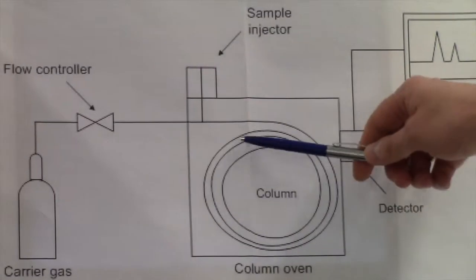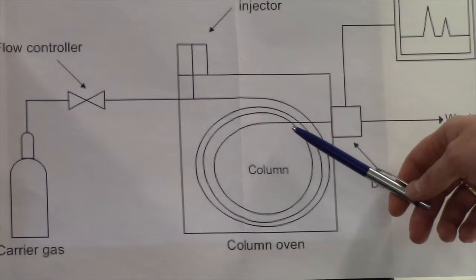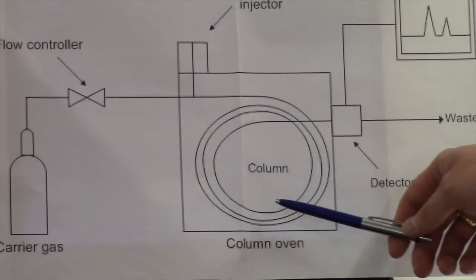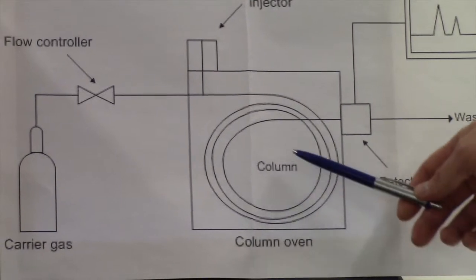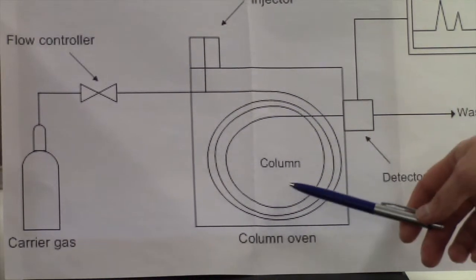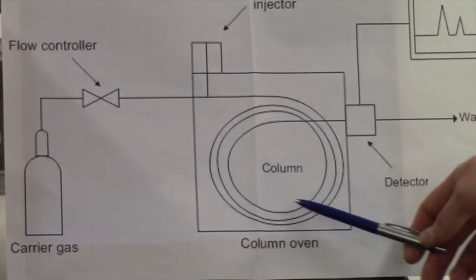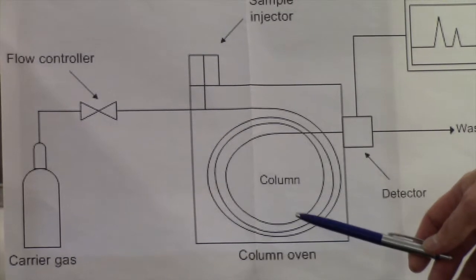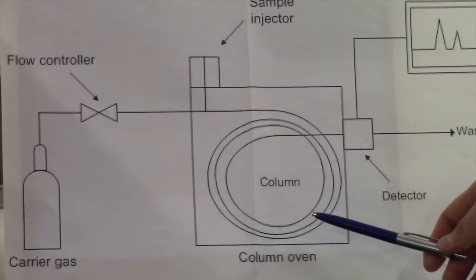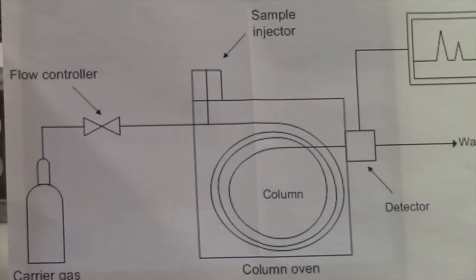On the basis of different size and other properties of injected molecules, they all have different times which they take to travel through the column, and it has a specific term, retention time.